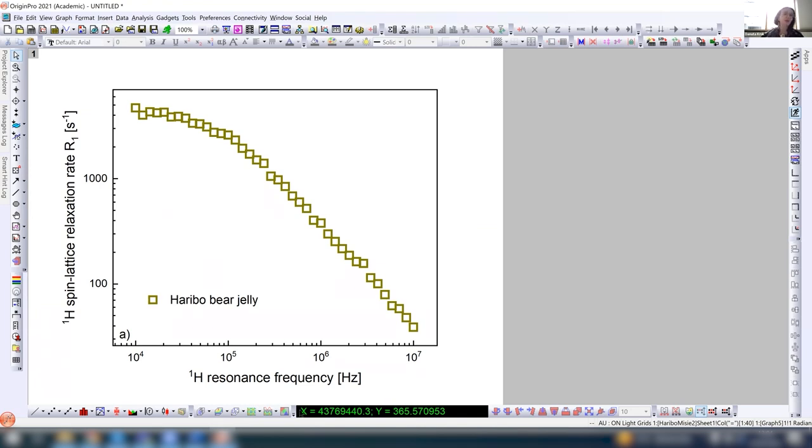So even looking at those values, one can draw some very important conclusions: it is highly unlikely that we just look at water dynamics. When one thinks about water, one usually says, and I suppose this is indeed true, at least a lot of experiments show that usually one has something like 2 pools of water or even more in sum. Usually 1 pool of water behaves from the point of view of dynamics more or less like bulk water.